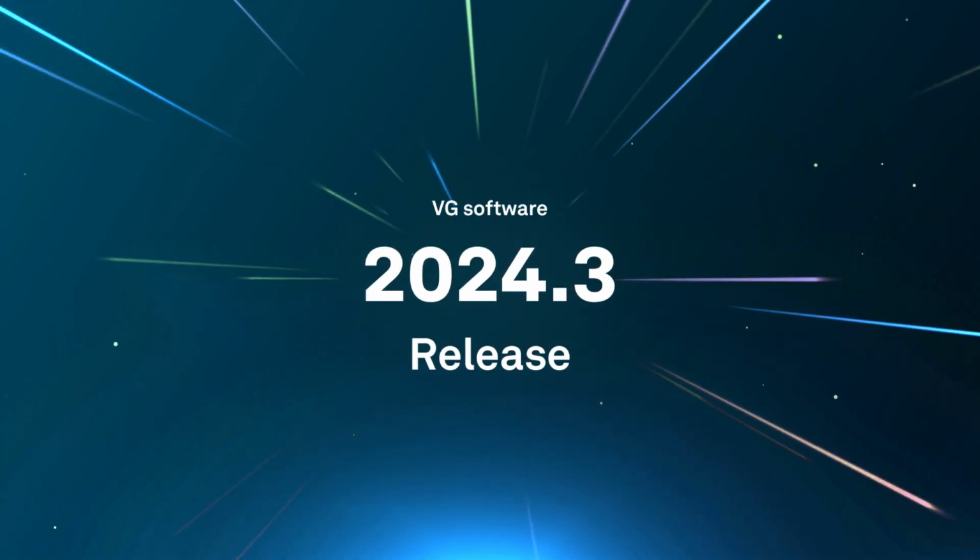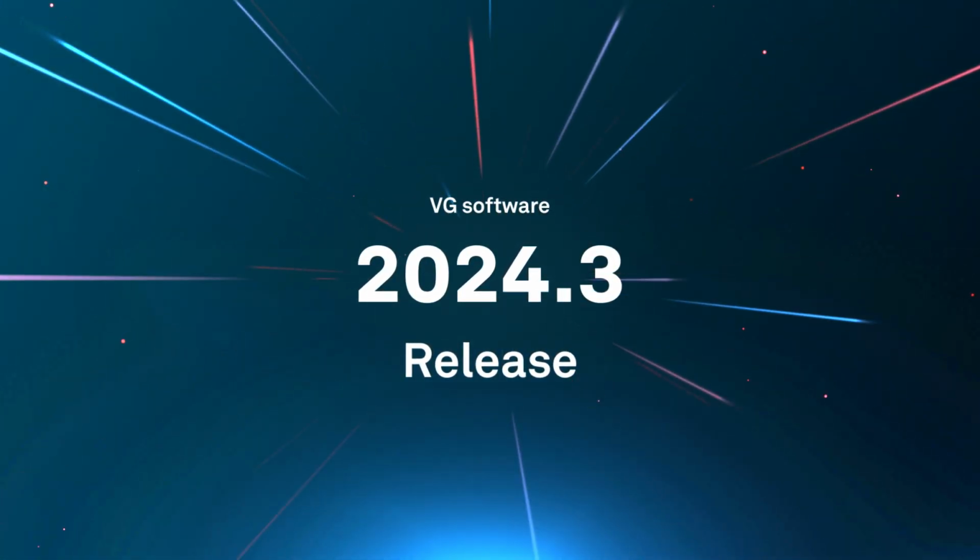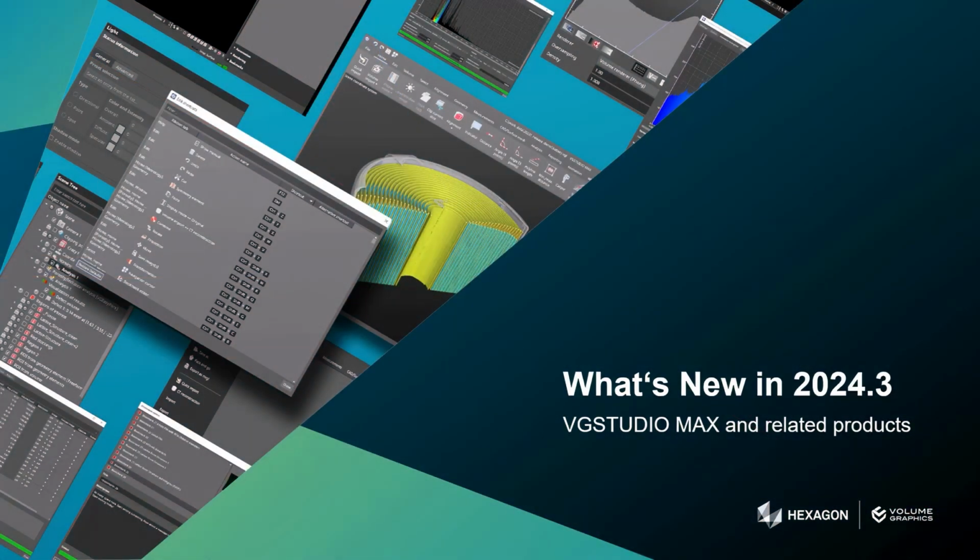Welcome to the What's New video for the 2024.3 release of VGSTUDIO Max and related products. It is going to provide an overview of the new features available in this version, with a focus on how to actually find and use them in the software.